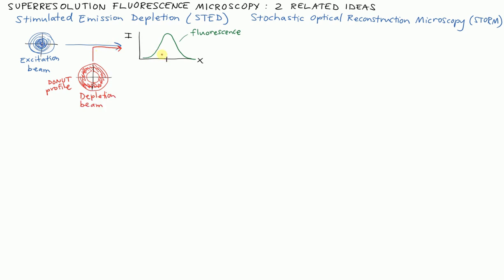So we'll draw a very low amount of intensity there in red. And away from there, it has higher values. So it's got high values out there and high values out there. And eventually it will come down again. So that's the pattern that we've got set up over here.